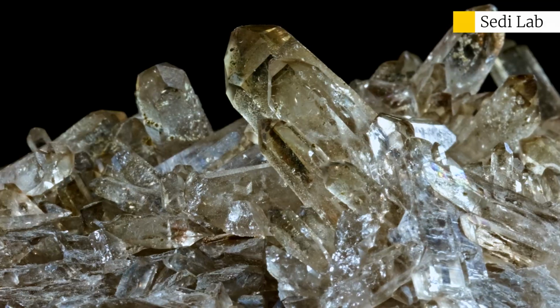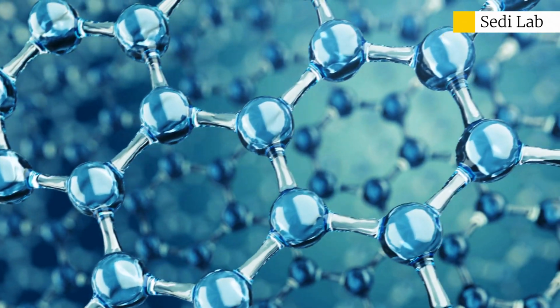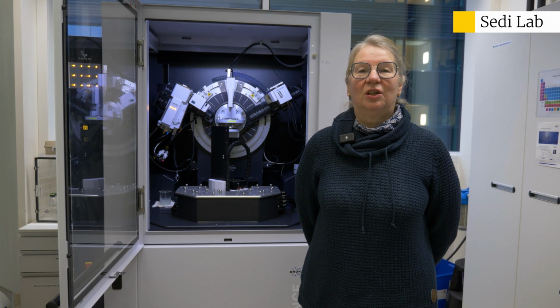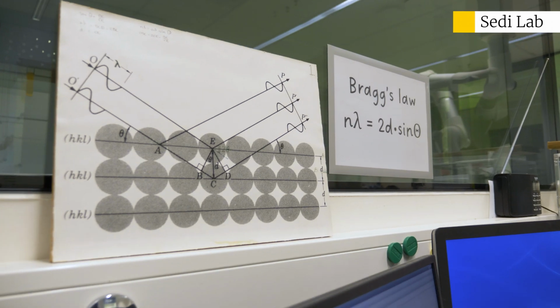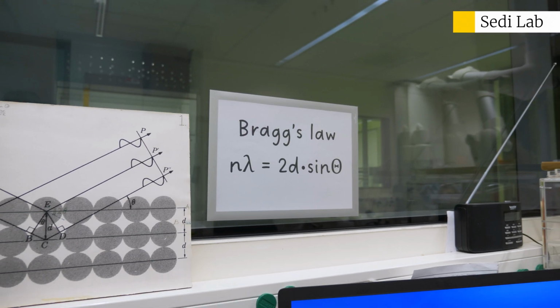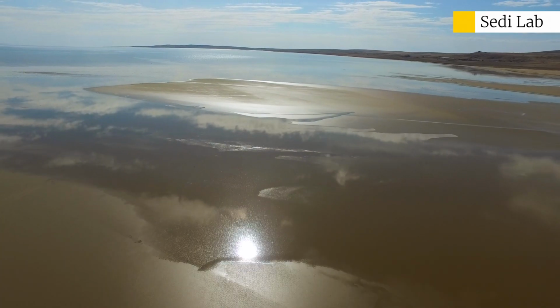However, if the X-rays consist of one wavelength and the material is crystalline, this means that the atoms are in a repetitive pattern. Some of the X-rays return from the material. This is when the angle with which the X-rays hit the sample satisfies Bragg's law. It's surprising how much material is crystalline, especially in geological samples like rocks and sediments and soil.